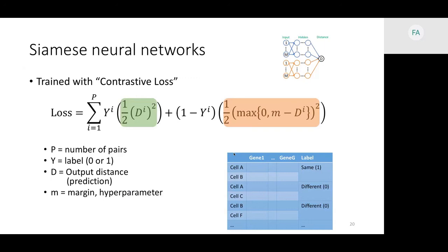But pairs of cells are coming from different experiments, right, from different labs, for which you label. Is it a problem that they can come from different platforms? For the Siamese training? Yeah. So the Siamese and triplet training are finicky and have issues, and we have looked into using that, but I haven't been able to find that it improves greatly by making sure that, when we're doing this comparison, they come from independent studies versus just taking different cell types.